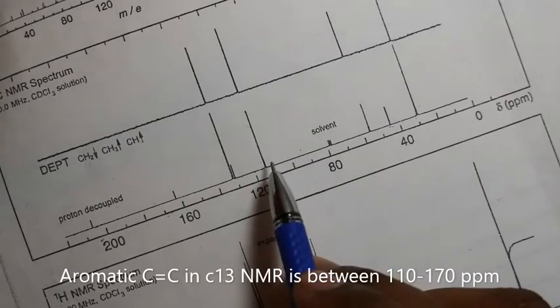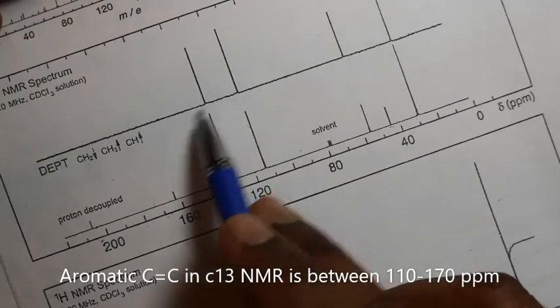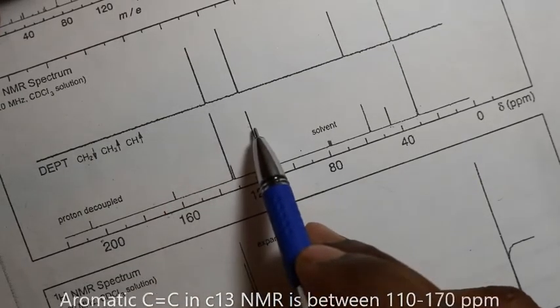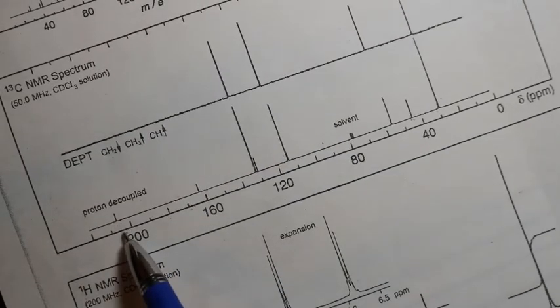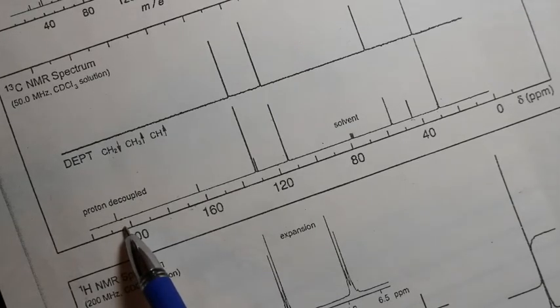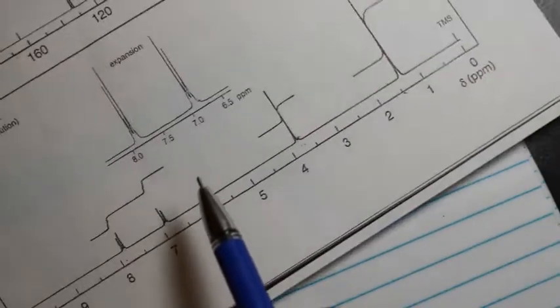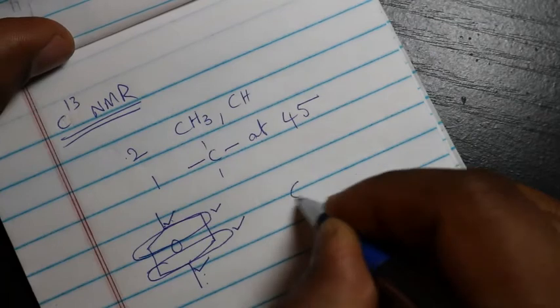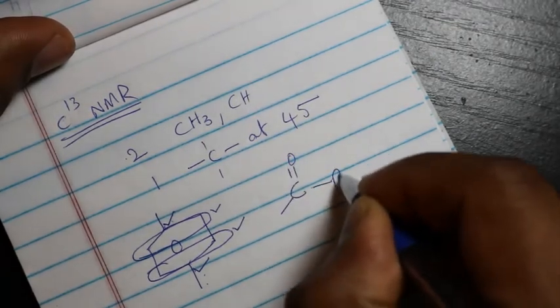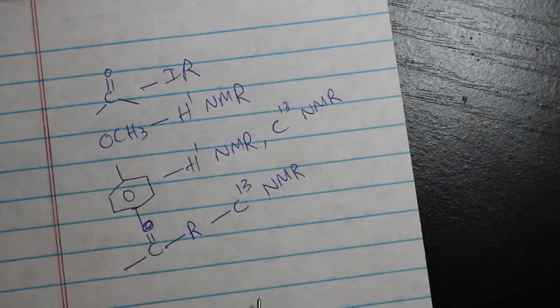In carbon NMR we are seeing 1, 2, 3, 4, and these two are quaternary carbons and these two are other carbons. So we are left with one peak here around 210. So what kind of peak will we see at 210? We see a ketone carbonyl carbon at 210. So from the carbon NMR data we confirm we have a ketone carbonyl but not an ester.